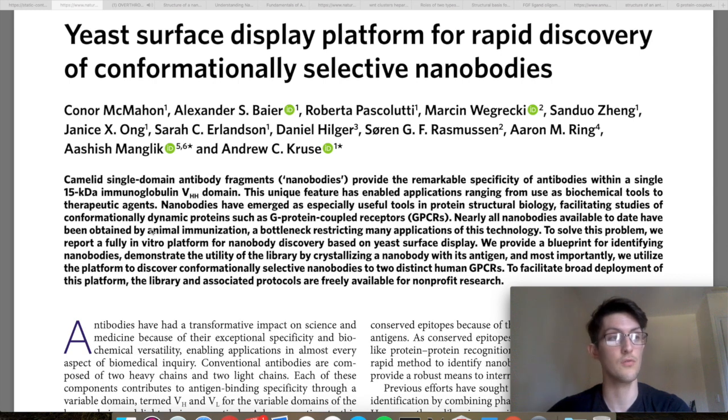nanobodies. I knew somebody who did this and got back something like 60 or 70 different sequences for nanobodies when she subsequently had to purify all of them and test all of them for binding to see which was the best one, because that's when you would scale up, for at least in her case, doing structural biology.